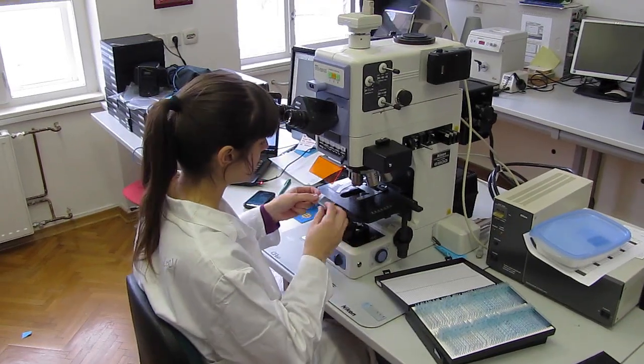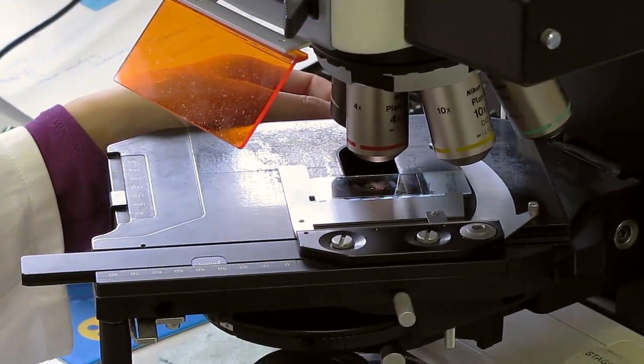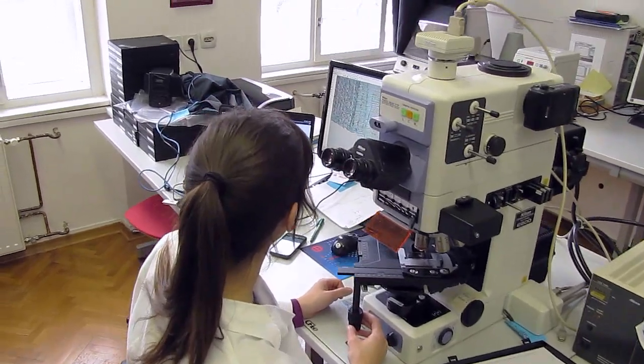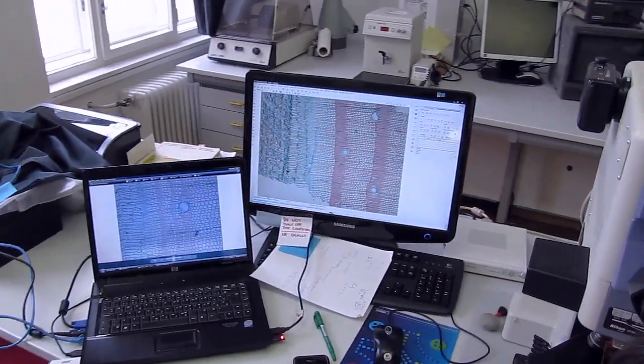Samples can then be analysed under the light microscope. The advantage of this preparation procedure are the high-quality sections, which enable the analysis of cambial, xylem and phloem tissues for further xylem and phloem formation studies.